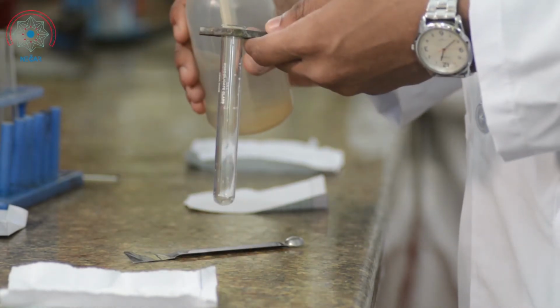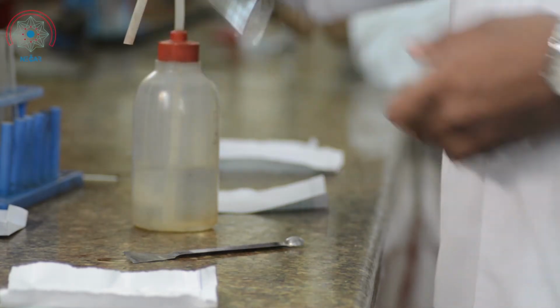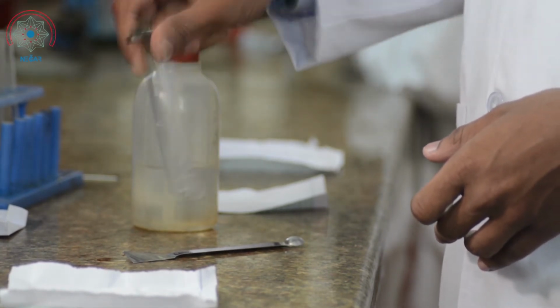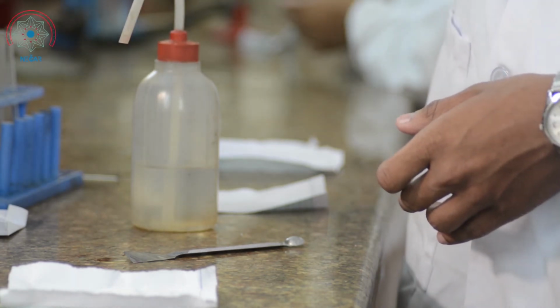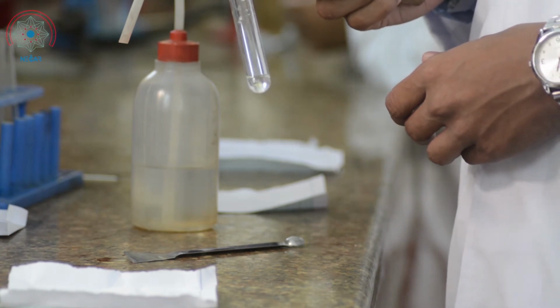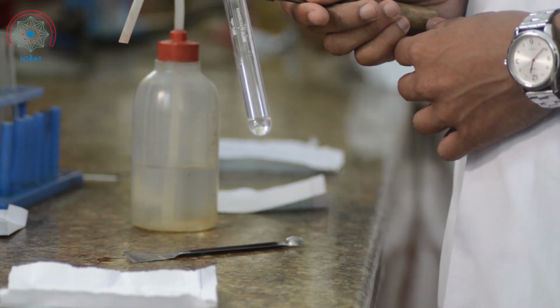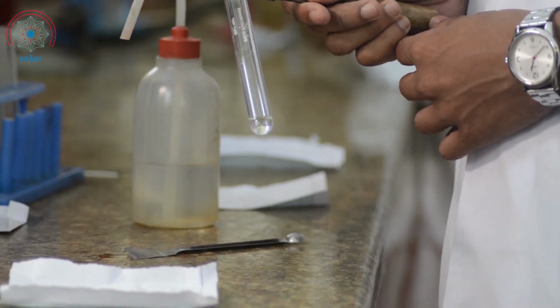Then we will add a little bit of water and check whether the compound is soluble, that is, whether it disappears in the water. If it disappears, we say it is soluble in water; otherwise it is insoluble. In that case, we have to check the solubility in other solvents like dilute HCl, concentrated HCl, etc.